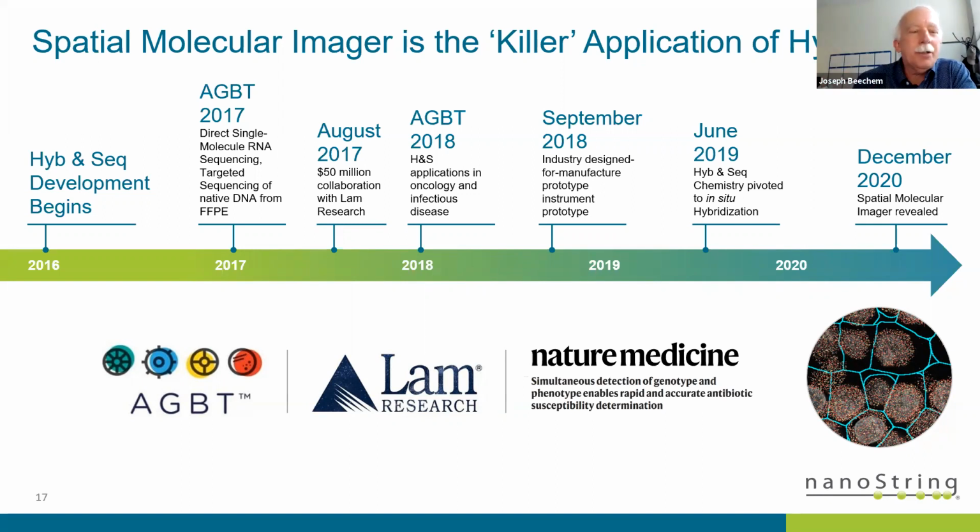We developed that early in 2016, and we were going to be developing a clinical grade sequencer with that. We actually published on some infectious disease detection with that in Nature Medicine. I think that was 2019, I believe. But as we're doing that, I was thinking it's a total hybridization-based sequencing reagent.